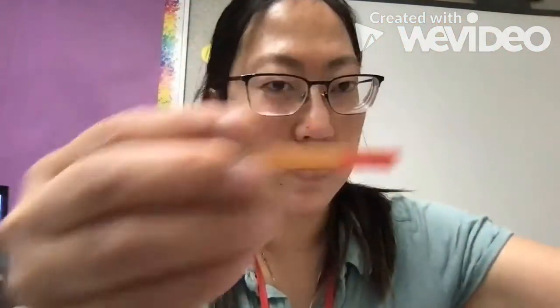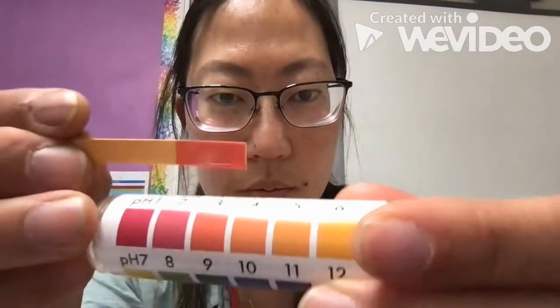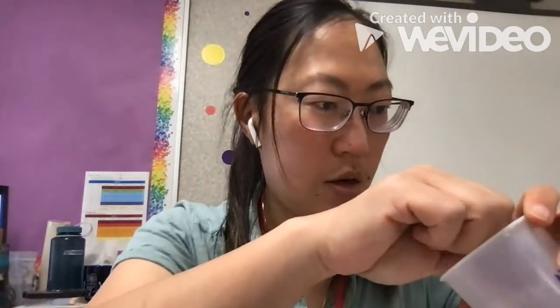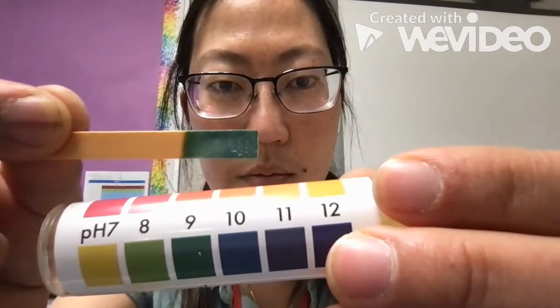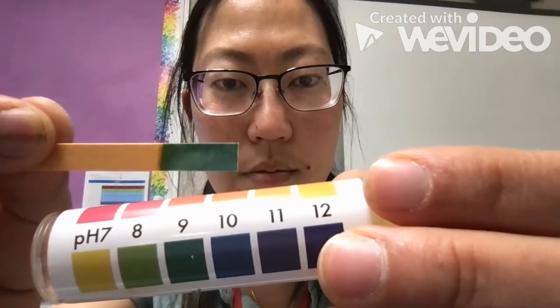Okay, so that's dry ice in water. Next, we have vinegar. And that's turning a reddish color. Okay, and then finally we've got ammonia. That turned blue. Bluish green. All right. So that's the pH paper.